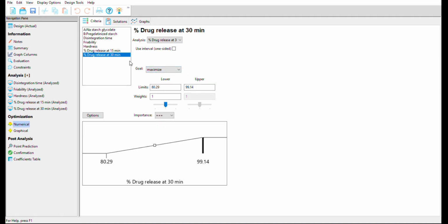So one question may arise: why have we checked the two release pattern times? Actually, for having robust data, we check the release pattern at 15 minutes and the release pattern at 30 minutes, because the ICH guideline tells about this.